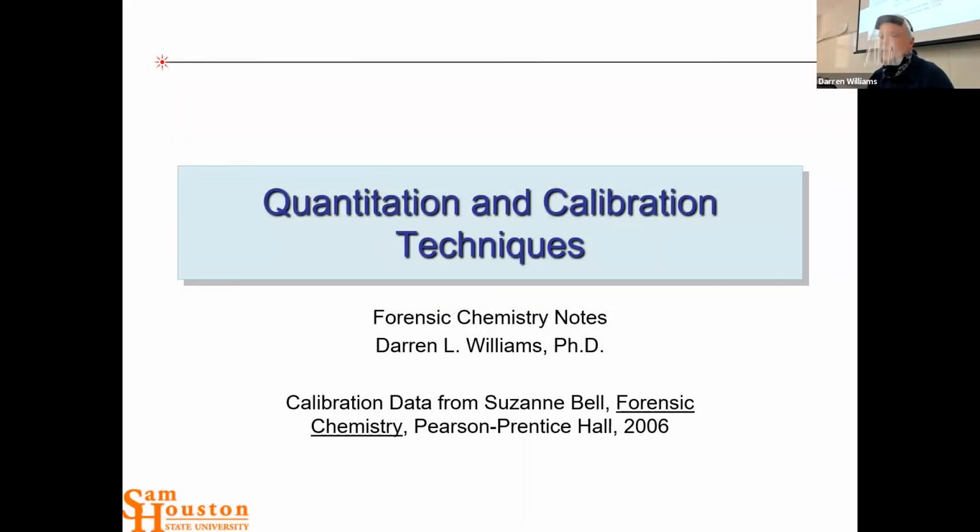We're talking about calibration methods and techniques, and we're going to start with what you did in quantitative analysis and any of the other labs, probably instrumental, where you use external standards, build a calibration curve, then do an unknown, etc. But then we're going to expand that to internal standards.